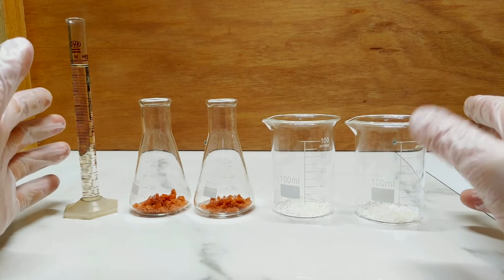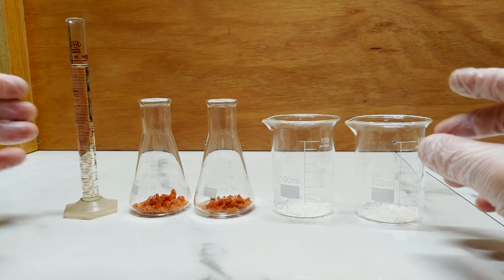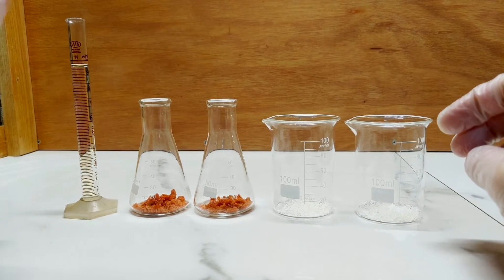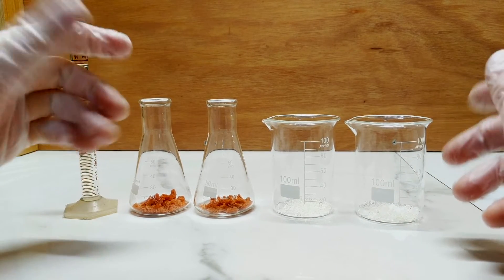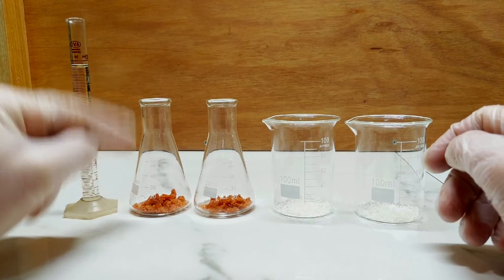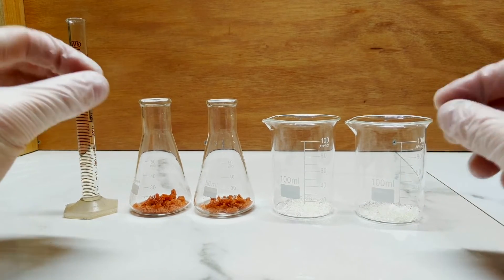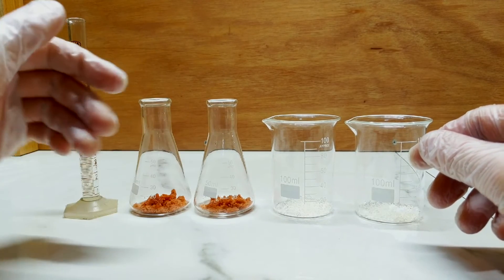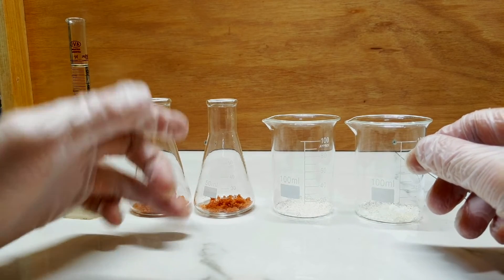The other problem I face is the literature on the subject was fairly scant, so I'm kind of roughly making up my process here as we go, or at least blind experimenting with some theoretical background. So essentially what we have here — cobalt yellow is a nitrite compound, a cobalt potassium nitrite, or a cobalt sodium potassium nitrite.